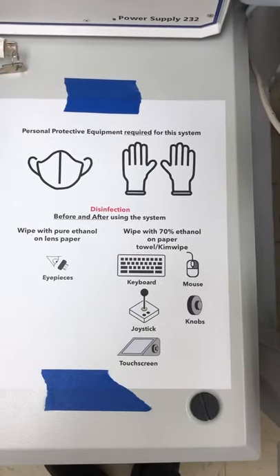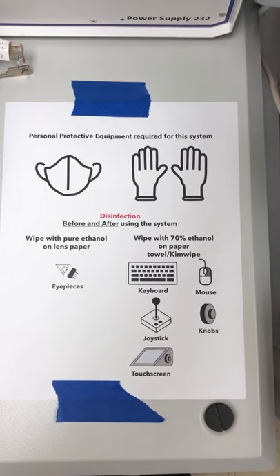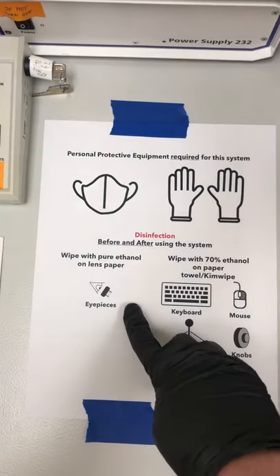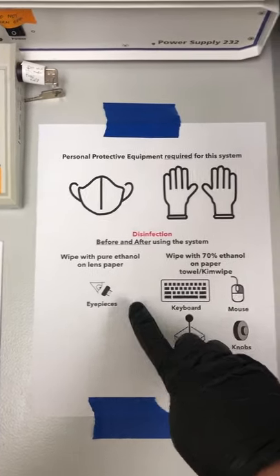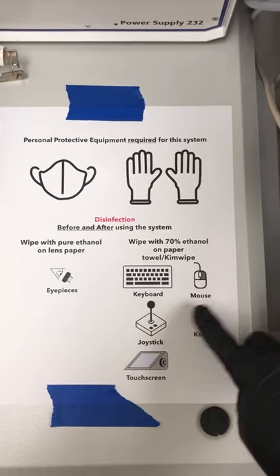So let's talk about disinfection. We need to do these things before and after we use the system. Before we use the system, we need to wipe with pure ethanol on lens paper the eyepieces, and then with 70% ethanol on paper towels or Kim wipes: the keyboard, the mouse, the knobs, the joystick, and the touch screen.